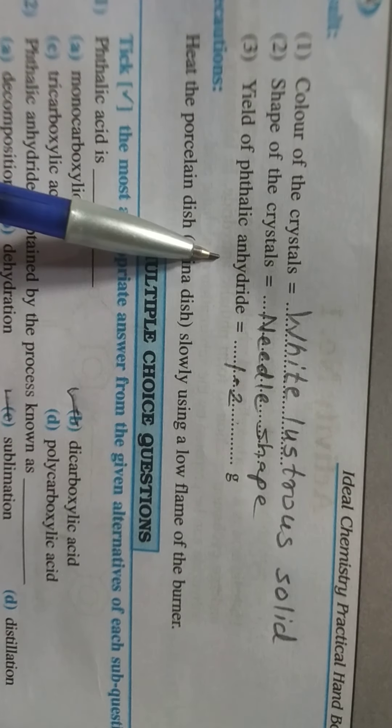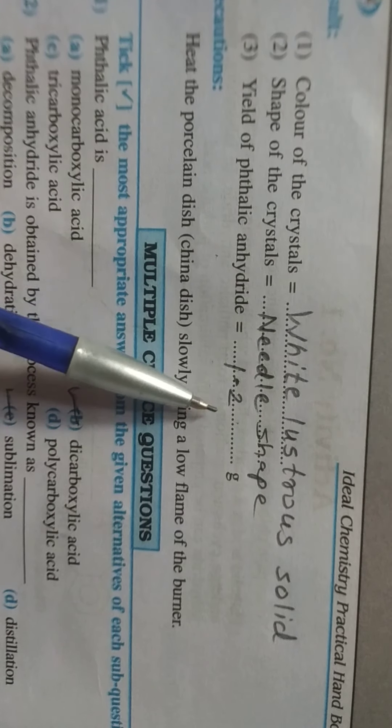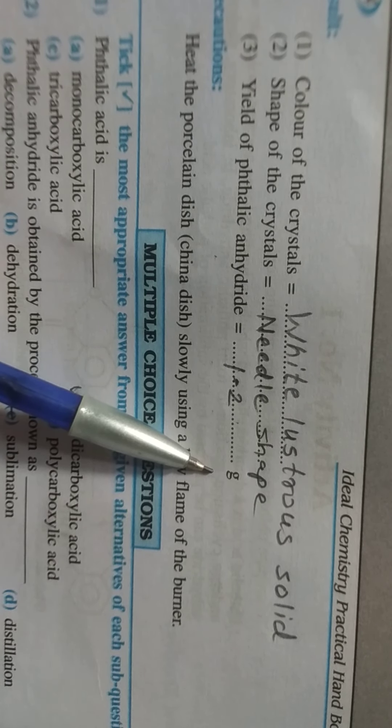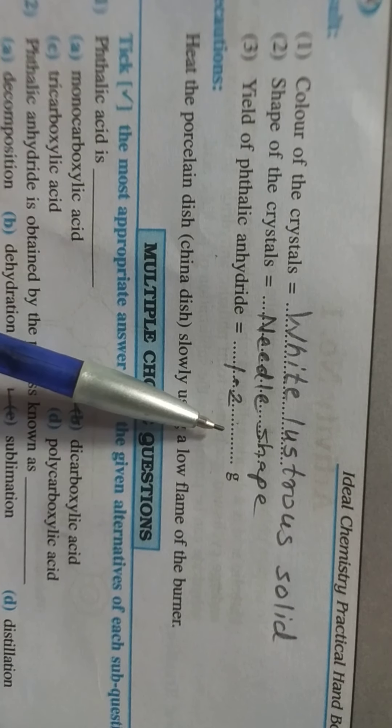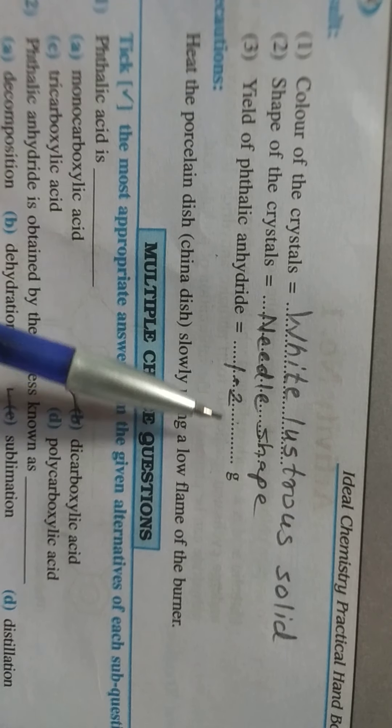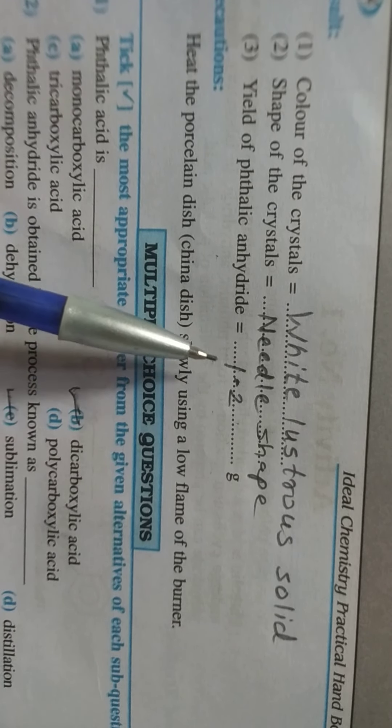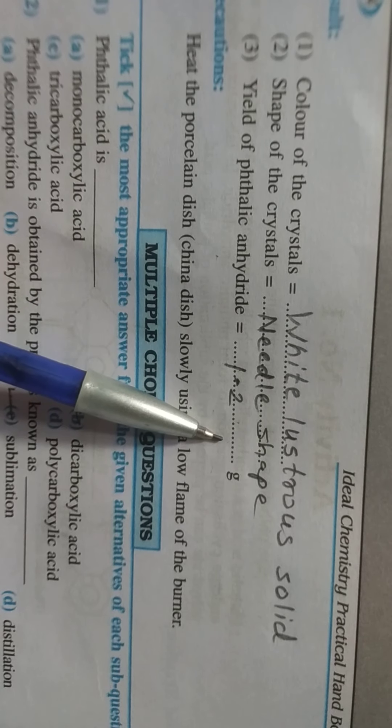And yield of the phthalic anhydride is 1.2 grams, because of loss of water molecule. That's why we obtain 1.2 grams of phthalic anhydride.